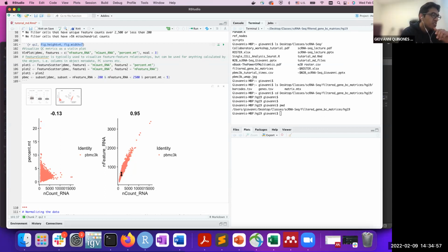And this plot is just to show you how the RNAs are getting distributed across your genes. In this regard, we'll probably be getting rid of the cells that have too many genes, so whatever is above this line, if we decide on 2000 or 2500.